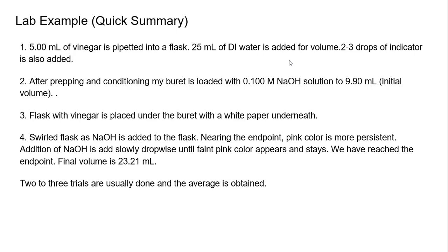Why are you adding water? To give it volume so you can see the color change easier. With 5 mLs, you wouldn't be able to see it. The water has nothing to do with your calculations. You are never going to use it. This is the only time I'm going to discuss it. Then you're going to add 2 to 3 drops of indicator.